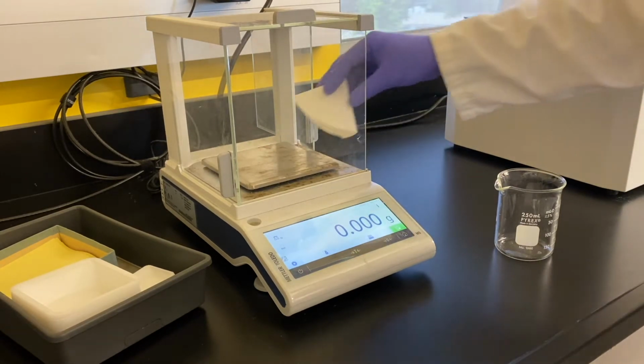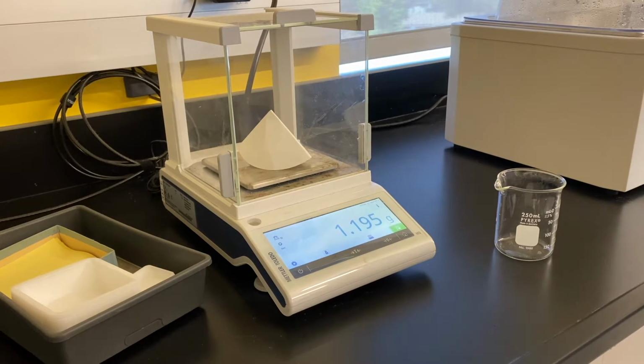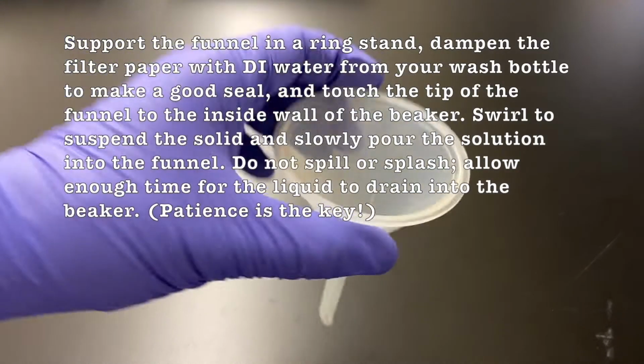All right, we're going to want to get the weight of this paper. That way, once we get a filter out of it and dry it off, we can get a mass of whatever's on top of the filter paper. And this will become clear later when we show you when we actually do it.